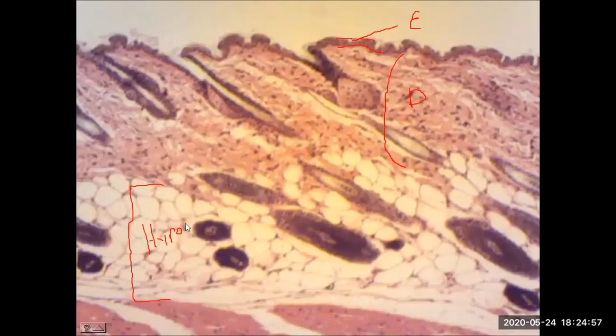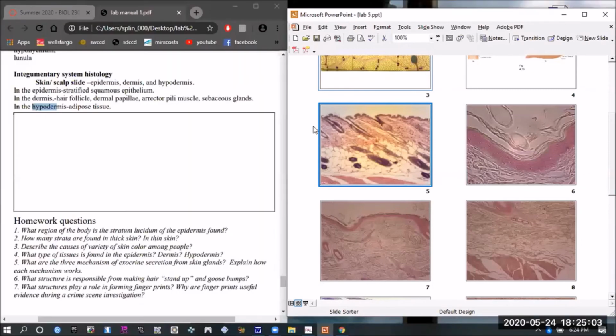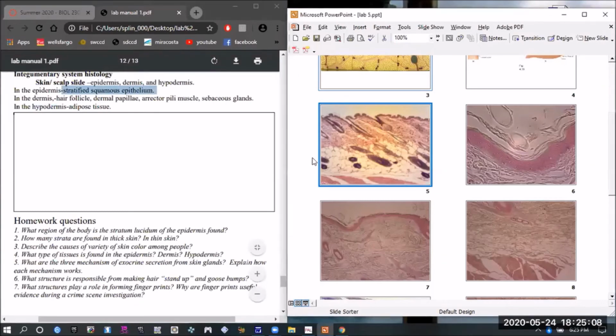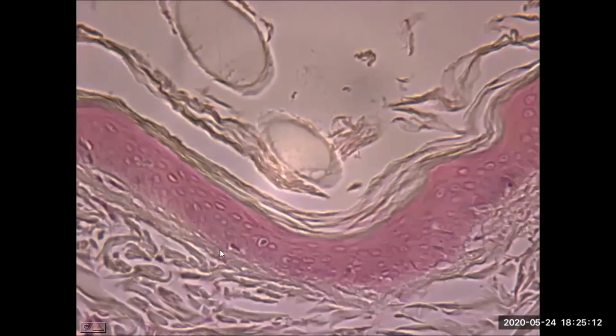So now for the details within the epidermis, you want to see the stratified squamous epithelium once again. We have an alternate skin sample we'll go to, zoomed in. From this area upwards is the stratified squamous epithelium. It's the dry type. And we're seeing that right here at the surface of the skin, right at the border of the sample.